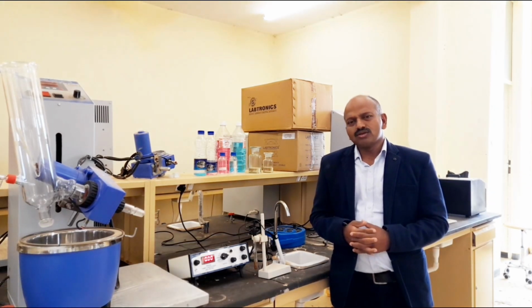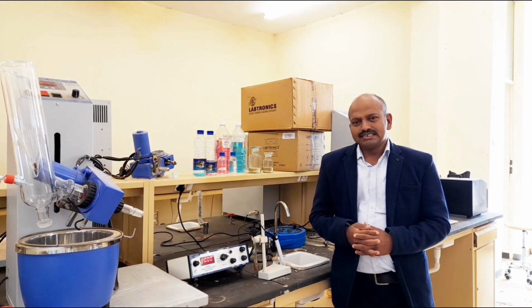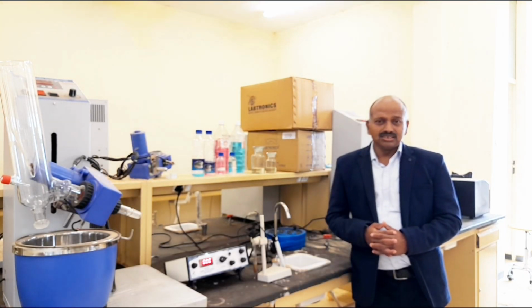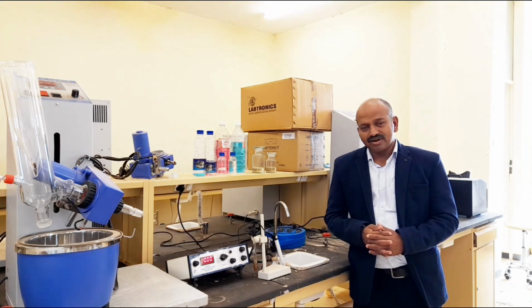The procedure for the volumetric analysis consists of two different parts. Part 1 is the standardization process and part 2 is the estimation process. Coming to part 1, that is the standardization of hydrochloric acid using a standard solution of sodium carbonate. Here sodium carbonate is the primary standard of known strength, taken as 0.05 normal. From that known strength of sodium carbonate, we estimate the unknown strength of hydrochloric acid. From this part 1, we will get the strength of hydrochloric acid.